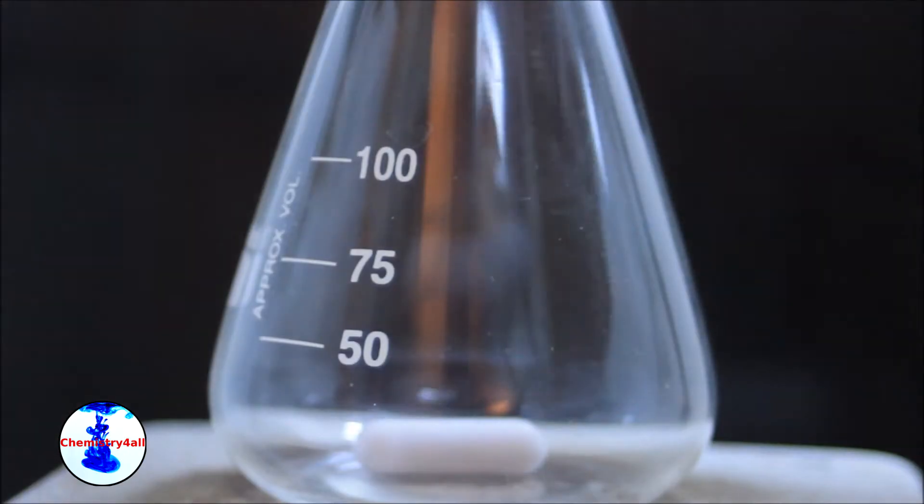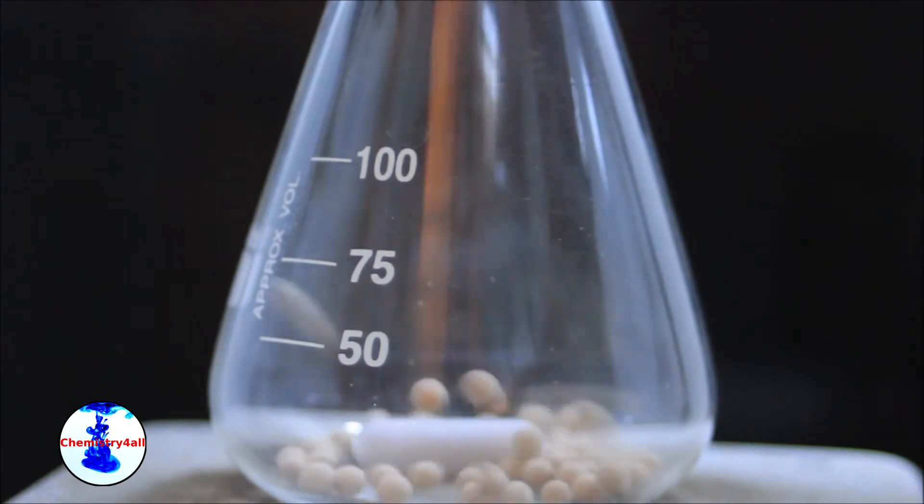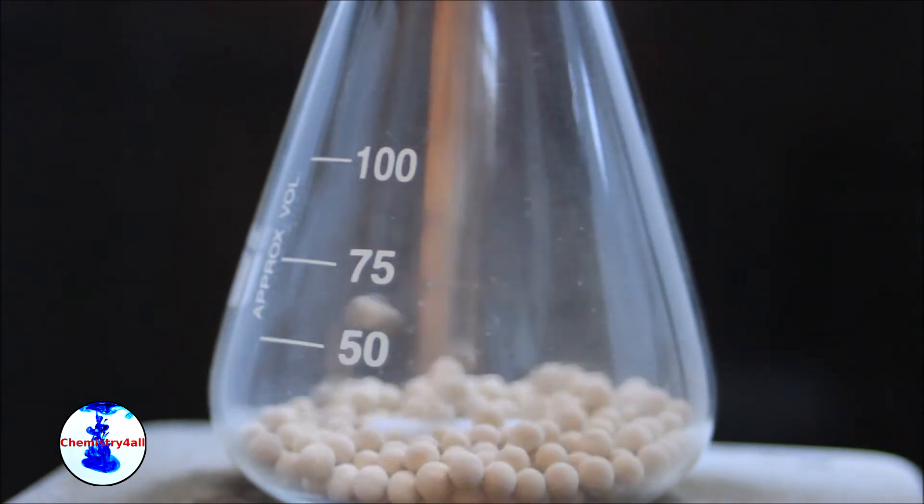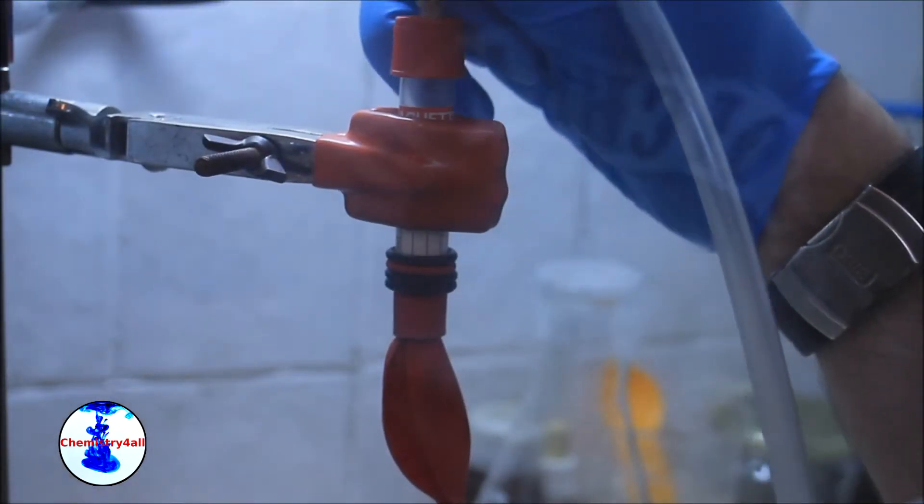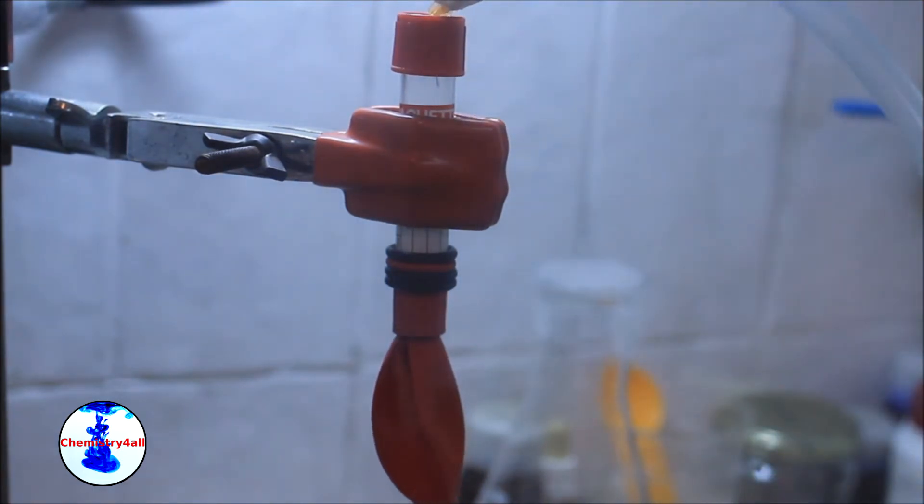Today, we will make anhydrous ethanol starting from regular 96% ethanol by making use of molecular sieves. Regular ethanol is usually fine for most applications.